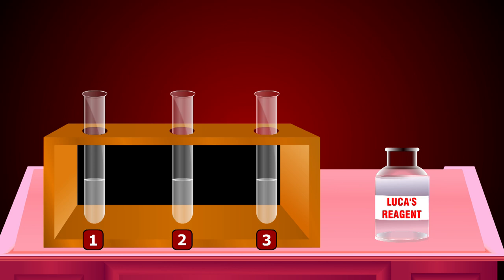The three test tubes contain primary, secondary and tertiary alcohols.